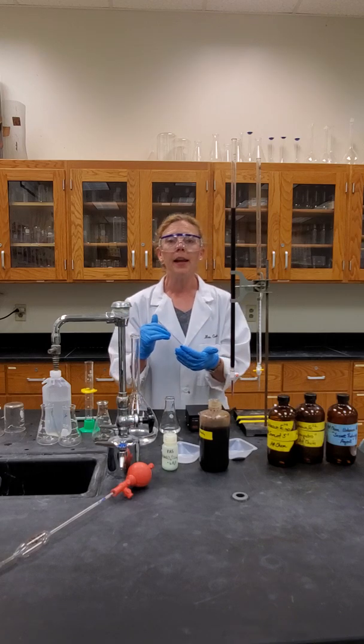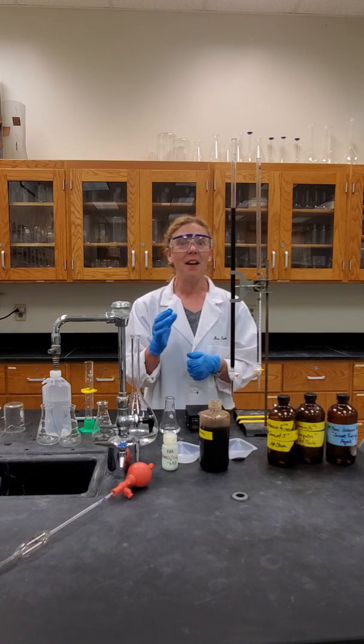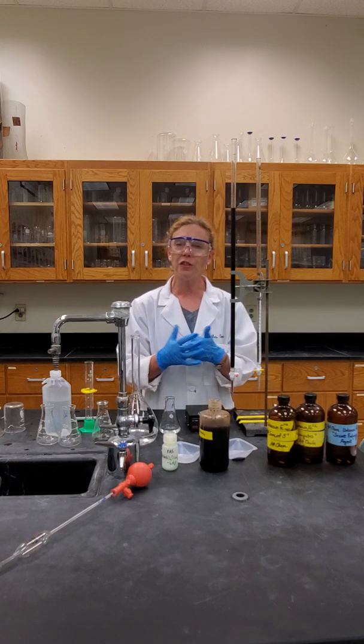We are also acidifying the iron solution, so we want to be extra careful. We're using three molar sulfuric acid and 85% phosphoric acid, which is a weak acid but of high concentration. We just want to be cautious in its handling.